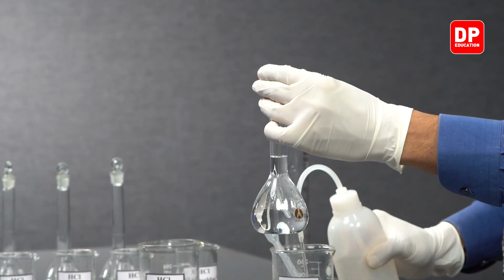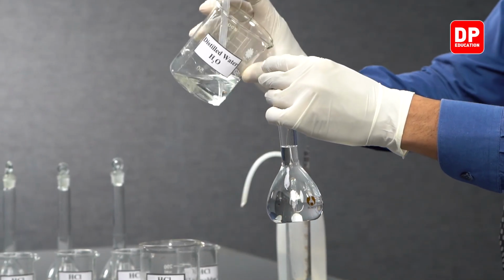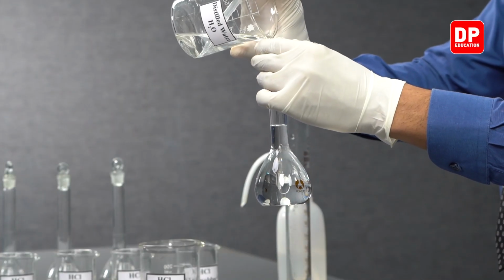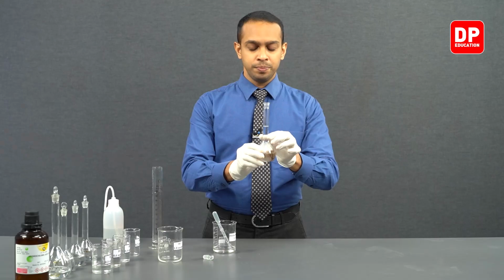And the final step. In this particular volumetric flask, the calibration mark is over here.